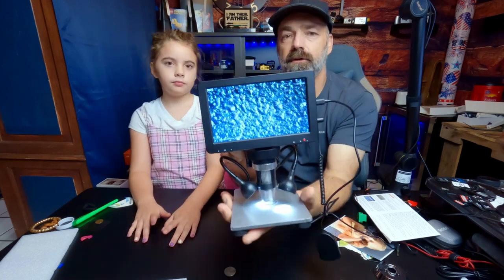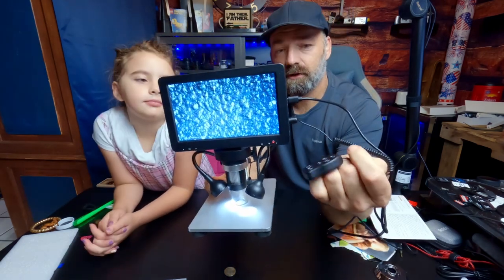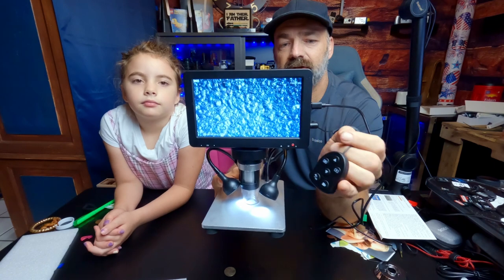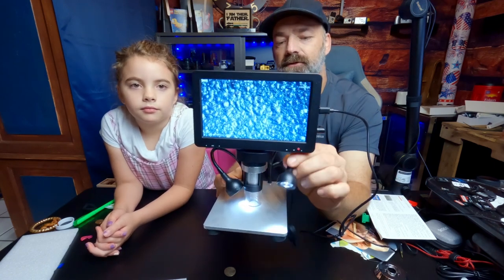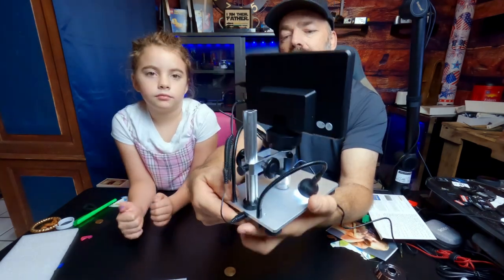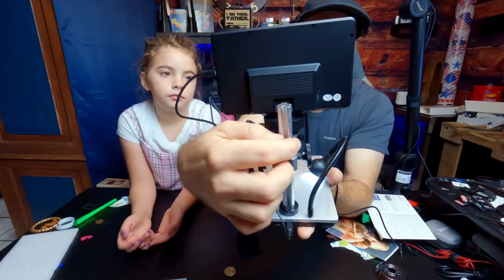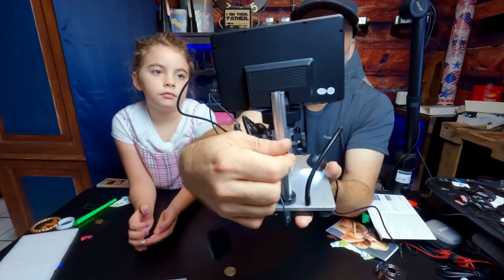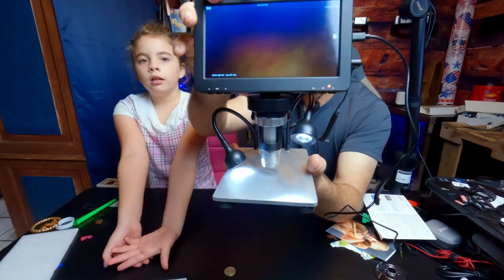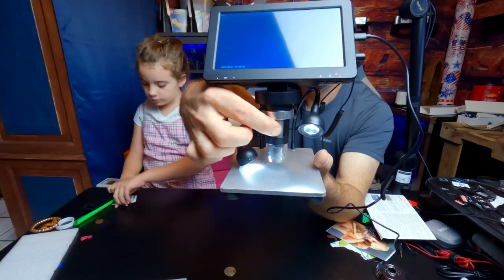I'm going to bring it up close so you can see some of the details. It has a color 7-inch screen, and a wired remote for controlling your menus and starting recording — because it records video in 1080p all the way up to full HD, and it also takes photos. It has two LED lights that are fully adjustable for brightness. On the back, you have the turning knobs for raising and lowering the microscope, and even a knob to lock it into place. On the front, this is the actual microscope connected directly to the screen. You can adjust the angle of the screen, and you also have the focus knob right here.